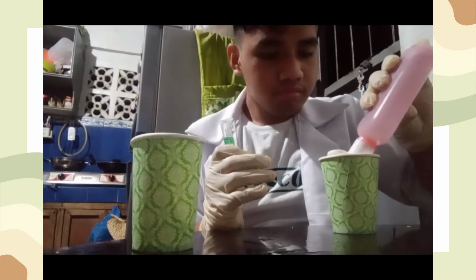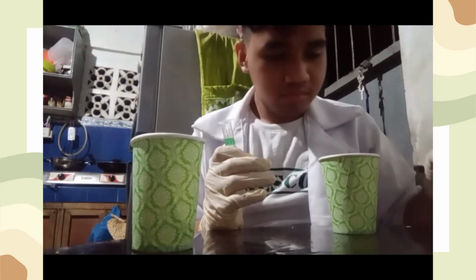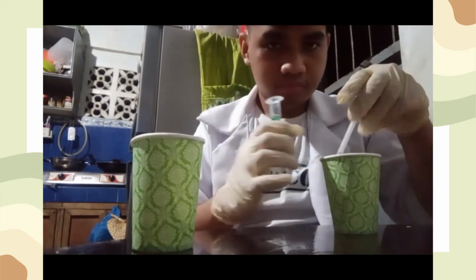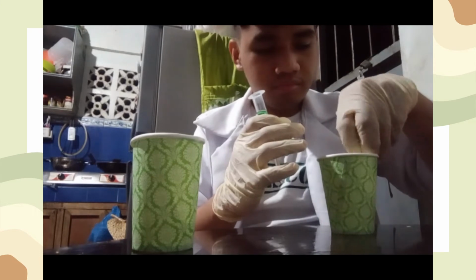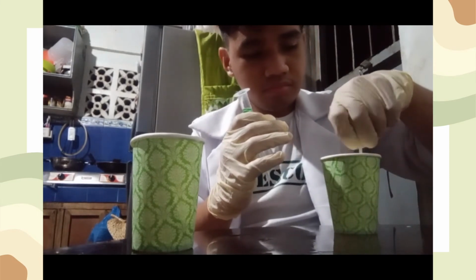Since the bottle of the alcohol cannot be opened, we're gonna pour an ample amount of alcohol into the paper cup. And then we're gonna get our improvised dropper and put an ample amount of alcohol into it.